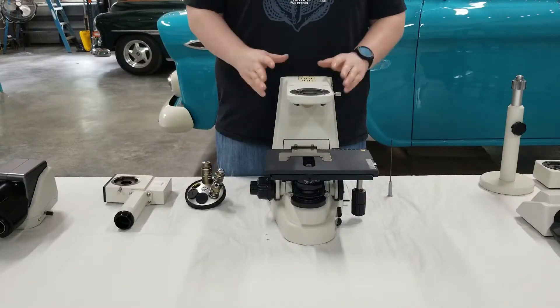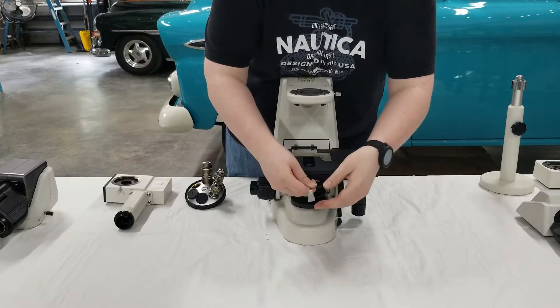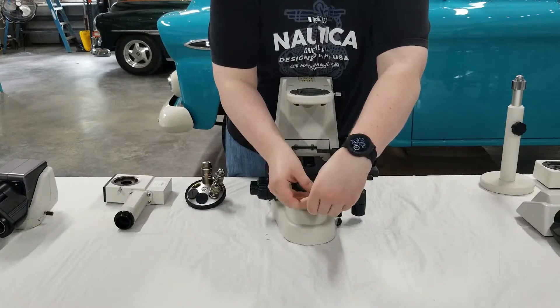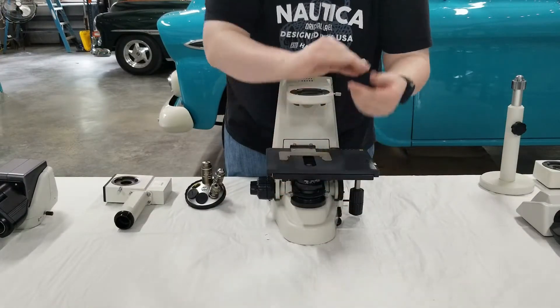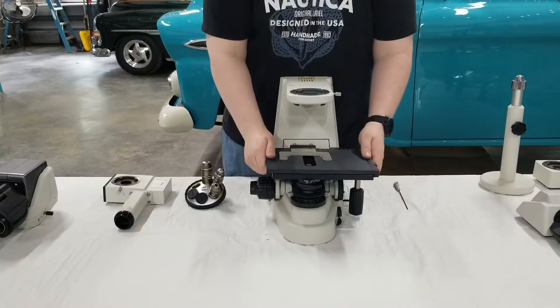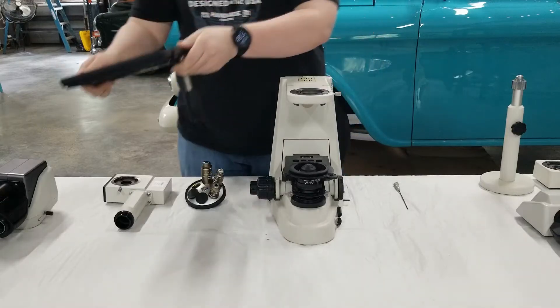For the next step we're going to show you how to remove the stage. You're going to take your wrench again — there's a small hole in the very front of the stage. Simply slip it in and loosen the screw a few turns. Once you're done, put your wrench to the side, lift the stage up, take it off, and set it to the side.